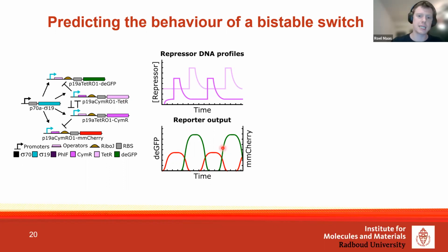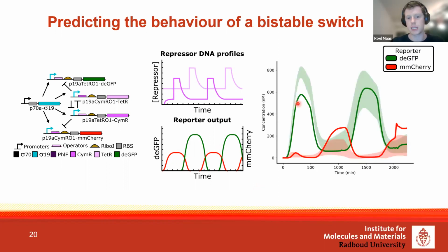So we performed exactly this experiment, and what we noticed is that here again the solid line is the actual data, and the shaded area are the predictions, and that we can get almost quantitative predictions of our system based on parameters which haven't been characterized using this system.